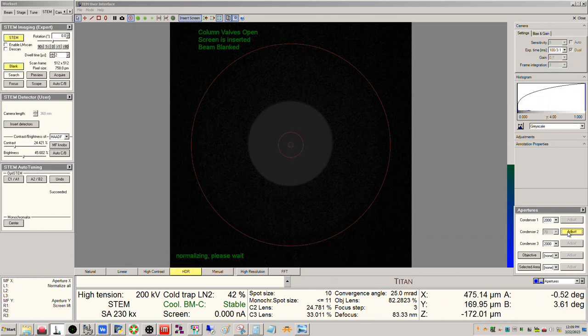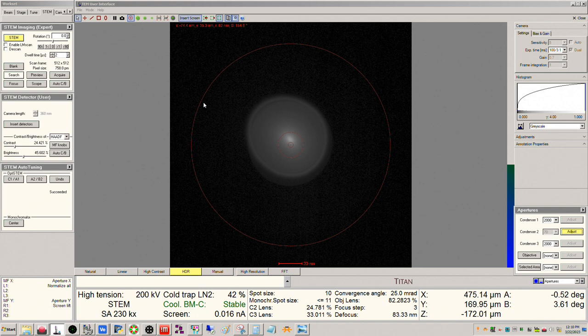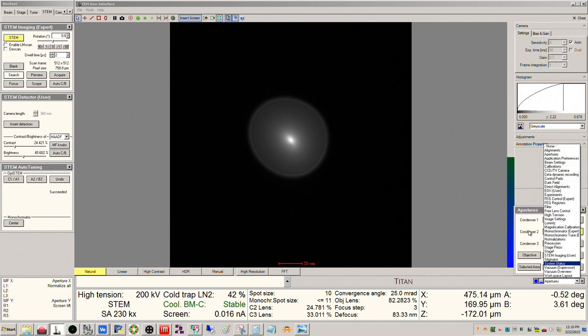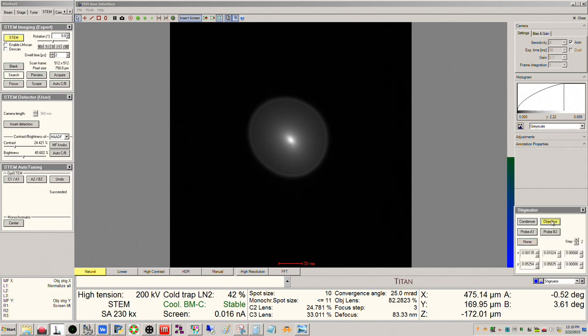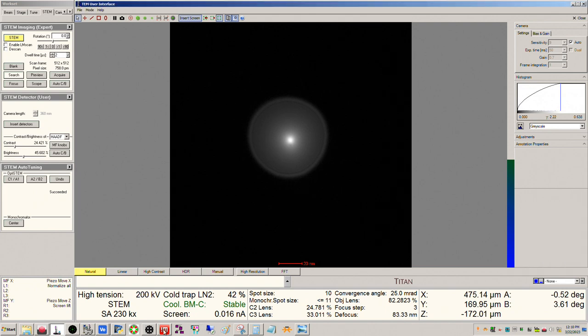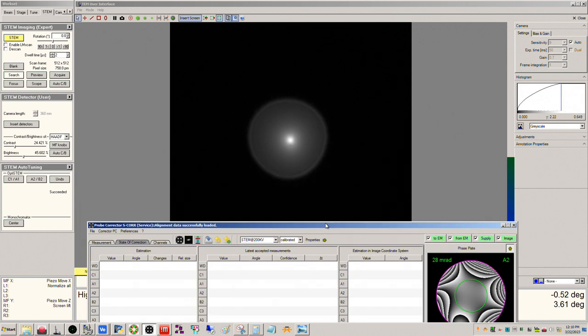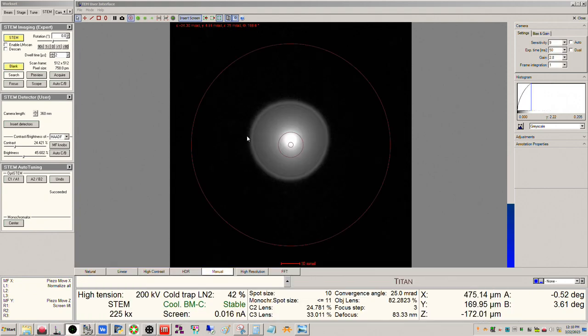So we'll turn diffraction off. Okay, and really it's not off by much here. So now you can see, right? So the probe looks astigmatic again. So now since we've corrected twofold in the probe, we know this is actually objective astigmatism here. Okay, so we can actually go back here, click stigmator objective. Okay, like that. All right, so this is off a little bit, not a whole lot, but we'll come back here and click beam tilt and go ahead and center it. Perfect. Okay. All right, we'll turn our screen marks back on, we'll turn diffraction back on.